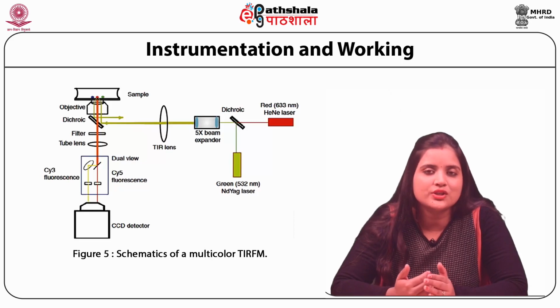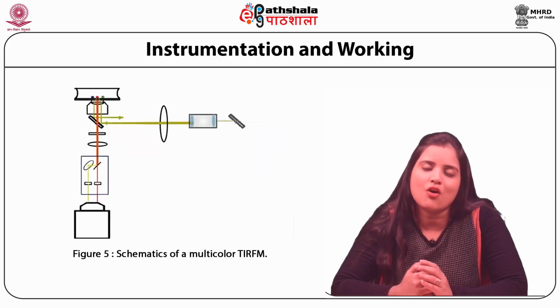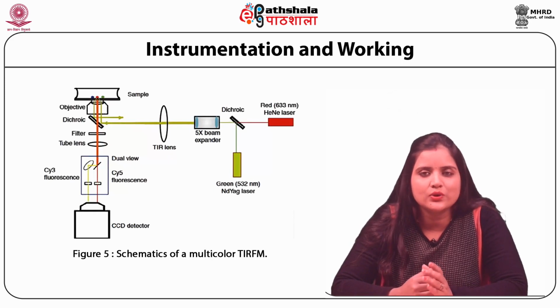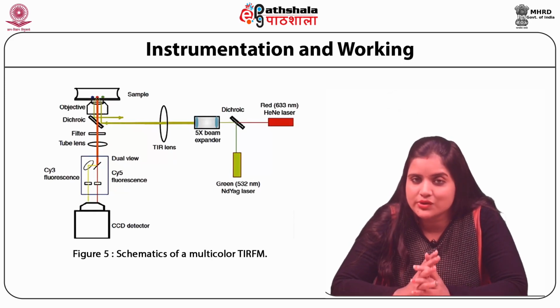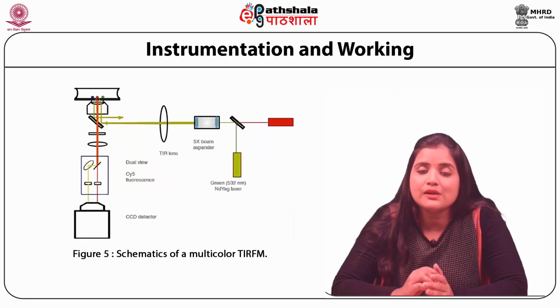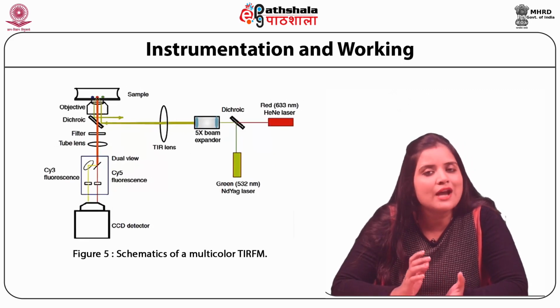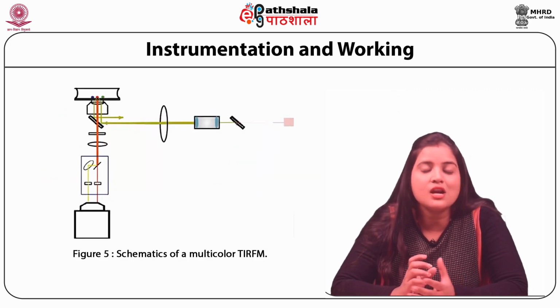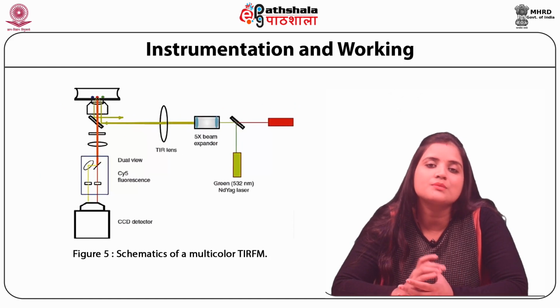We will now study the applications of fluorescence microscopy. The intracellular macromolecules distribution in various structures, for example, membranes, cytoskeletal filaments, and chromatin, can be analyzed using fluorescence microscopy.